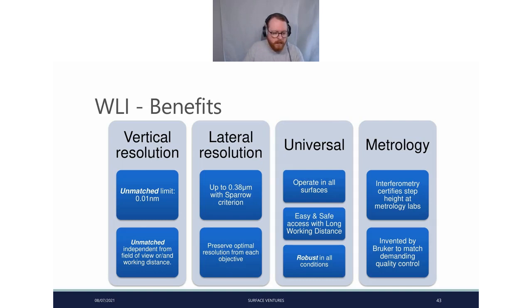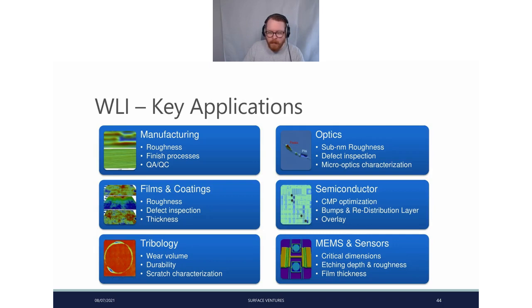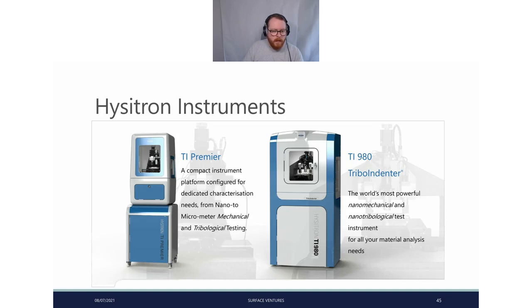And there are various different applications to this: manufacturing, optics, films and coatings, tribology, MEMS and sensors. So I'll release the data sheet for the Contour X500 if you're interested in taking a look at that. We have the Hysitron indenters, so the TI Premier, which is the slightly more compact version, and the TI 980, which we'll be getting a demo of quite soon.